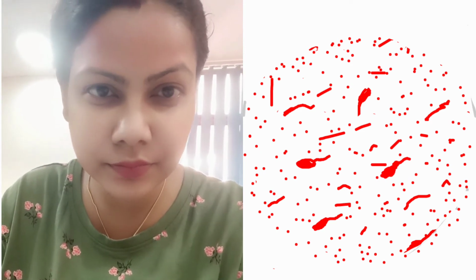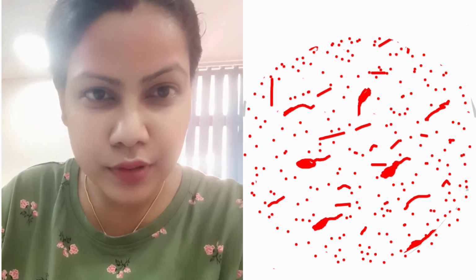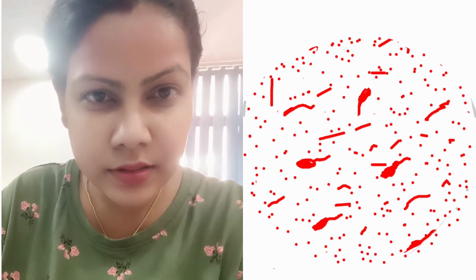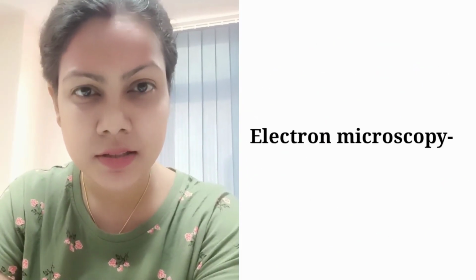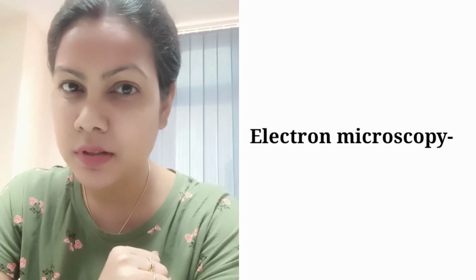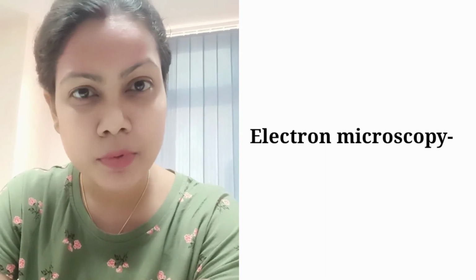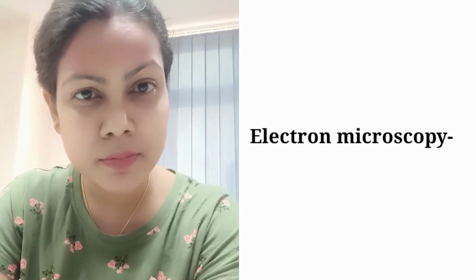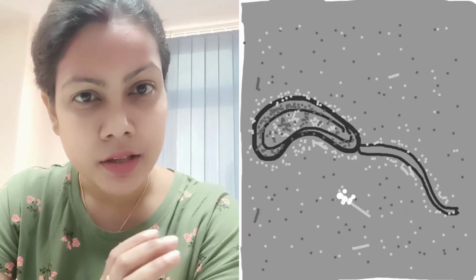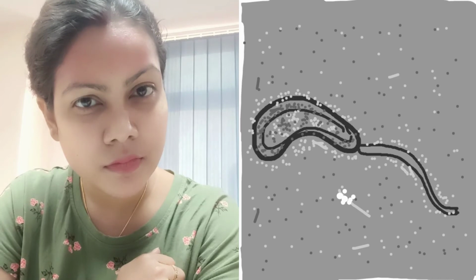Okay. Now, let's go for another method of flagellar detection. Another direct method of flagellar demonstration is observation under the electron microscope. Under the electron microscope, flagella will be visible as in the image shown in this video.